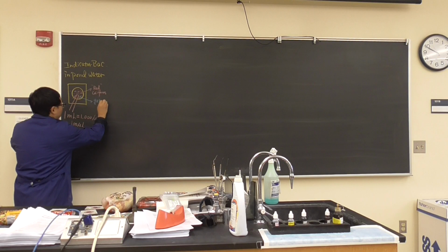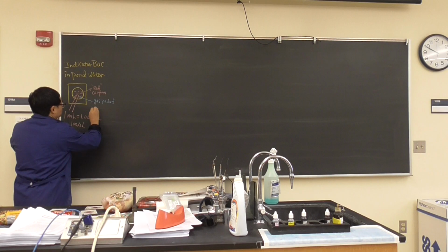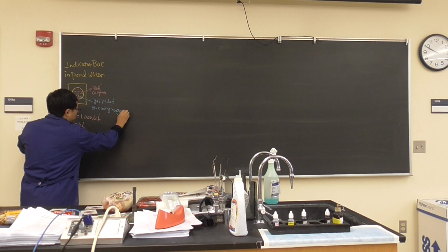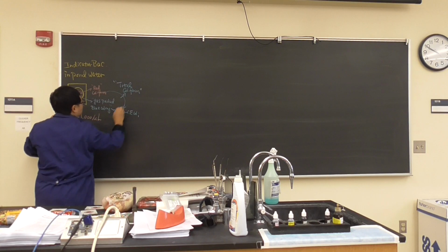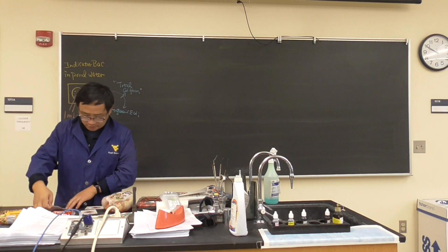Gas-packed blue colony. This is E. coli. I would say generic E. coli. And this one you add up together is coliform, and we don't always say coliform, we say total coliform. Okay, this is important, that's why we want to review. And these we'll just put on the side.